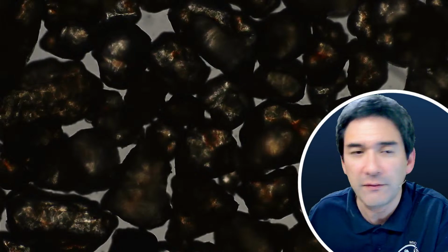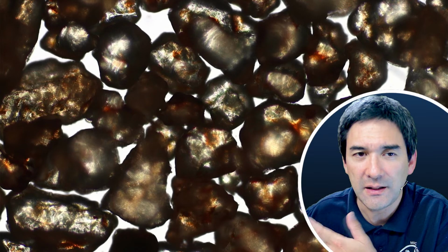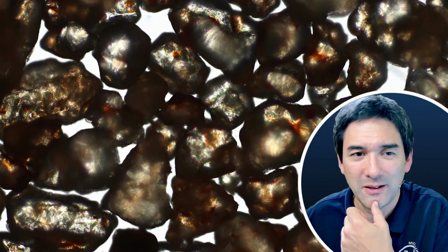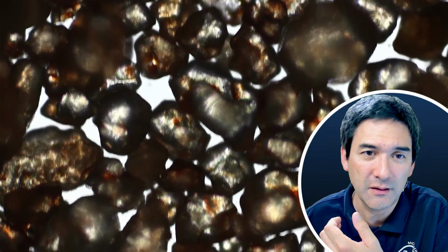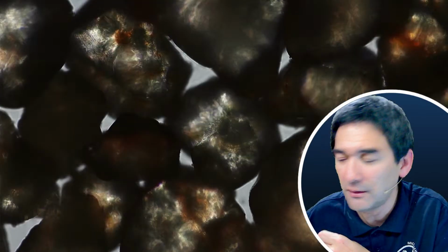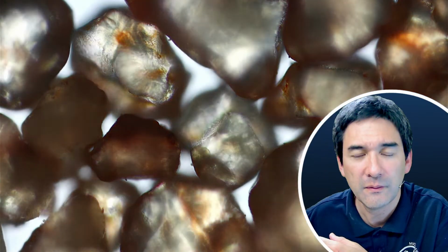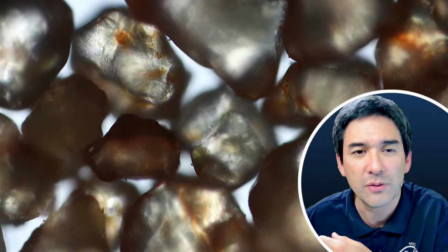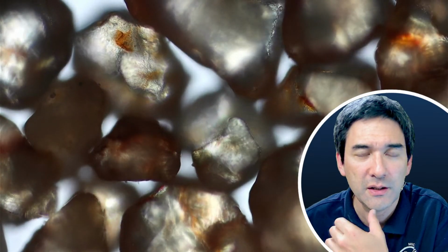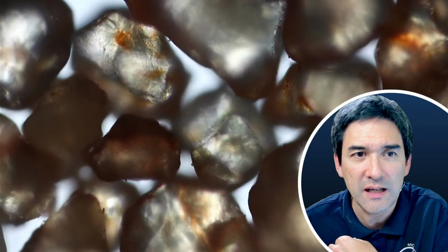So I'm going up with the magnification now. Okay, so now we're able to see a little bit of the color, right? But again, I think it doesn't look quite as good. But it depends on what you want to look at, and the magnification, however, is much higher. That's a 10x. This is now the 20x objective, and you see it still works. Okay, and I'm going to put in the condenser as well. Depth of field is very narrow, and then you're also able to see that not all parts of the sand grains are actually stained red.